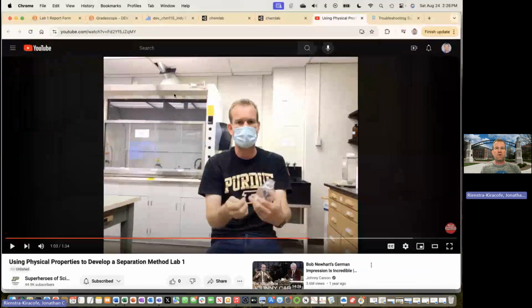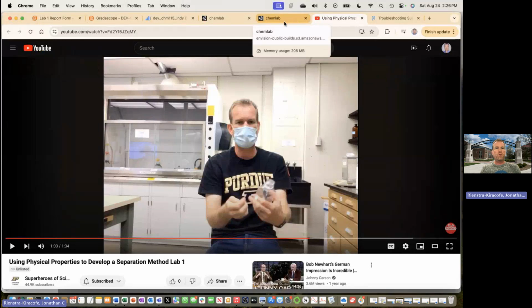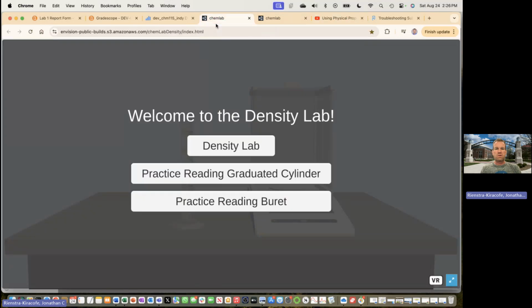So let's go back over here, and that simulation will open up in your web browser. I would recommend Google Chrome, okay? And let's see, here's the simulation. When I come here, I get to this simulation page, and I'll see that I got a couple different tabs. How do I know what to do?